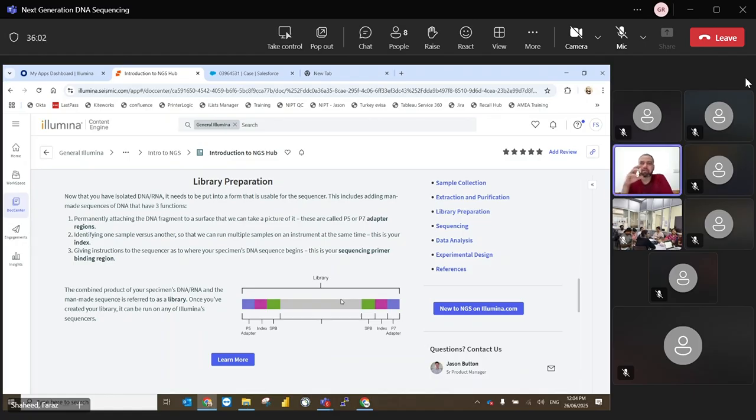So you have to calculate what is needed, because if people want to do very accurate, high coverage whole genome sequencing, they might go for physical fragmentation. Some applications need sonication to be more accurate, but most applications can give results even by enzymatic methods. So don't think about which one is good or which one is bad. It depends on the situation and conditions. You need to evaluate what is worth it for you.